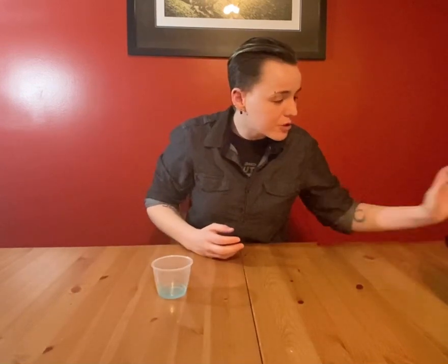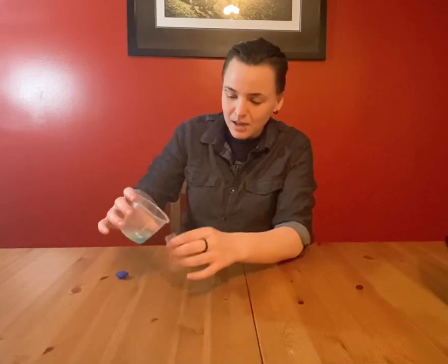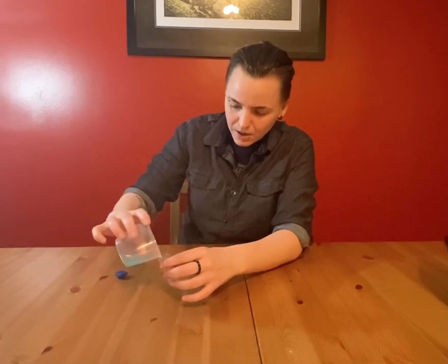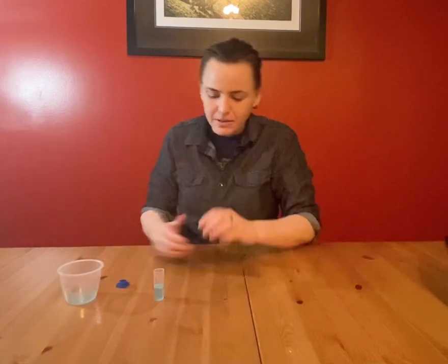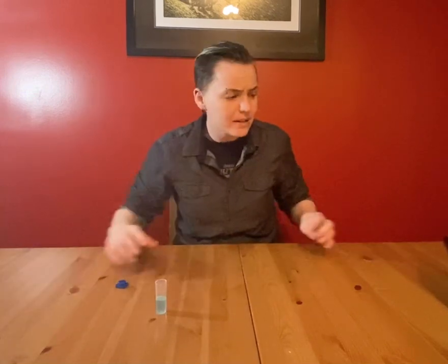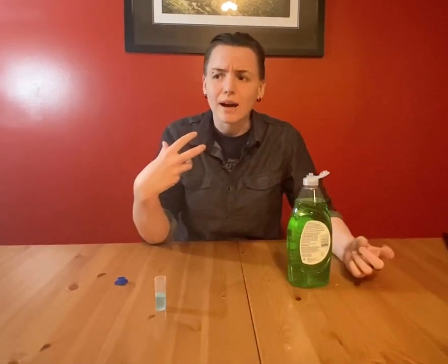So the next thing that you're going to do is take the test tube that I provided to you, and put about half of this solution in this test tube. So that's about half of that solution. We'll just set it to the side. So your saliva will have your DNA.